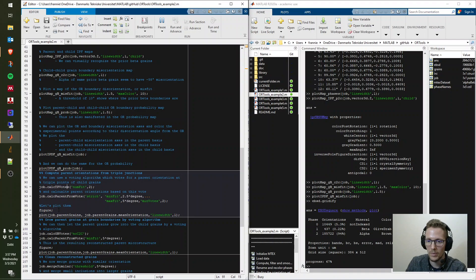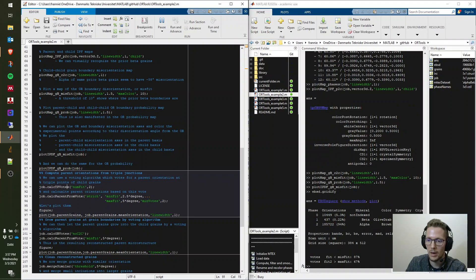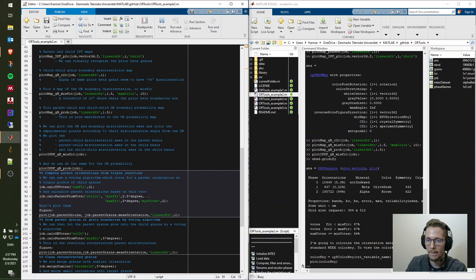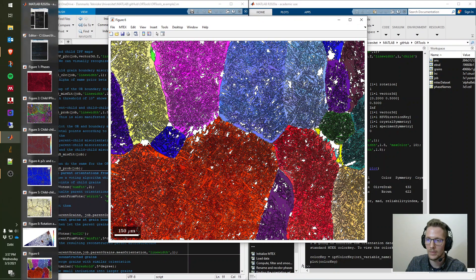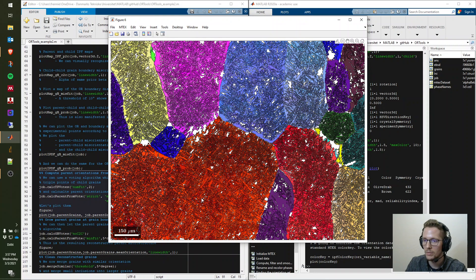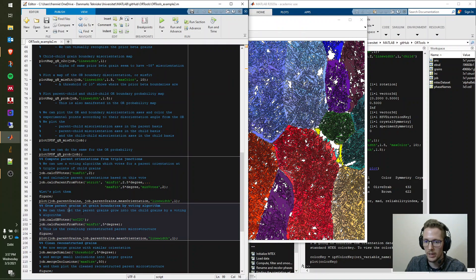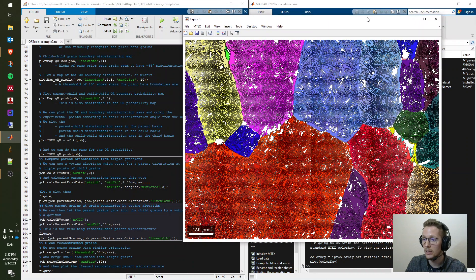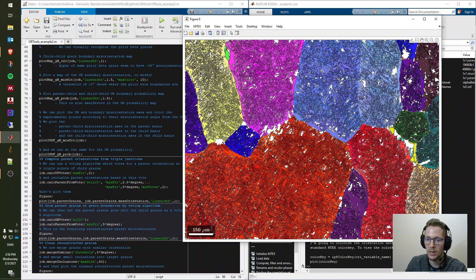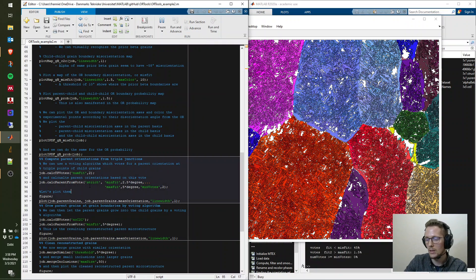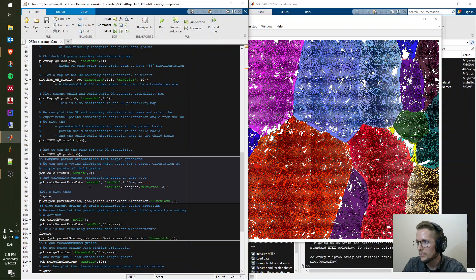We start the reconstruction — it's quite fast. We then plot the parent grains with their mean orientations. The result is convincing; most grains fit well with what we expected from the child grain observations. We can still improve this: since we now have a lot of reconstructed parent phase, we apply the voting algorithm to assign parent orientations to grains that haven't been reconstructed yet, based on their surrounding parents.